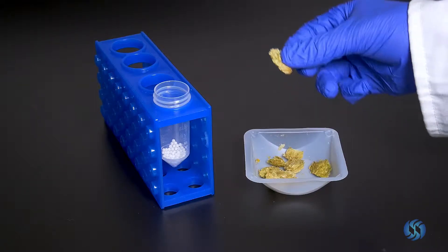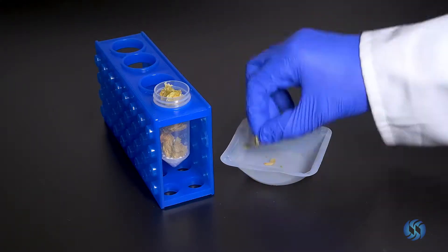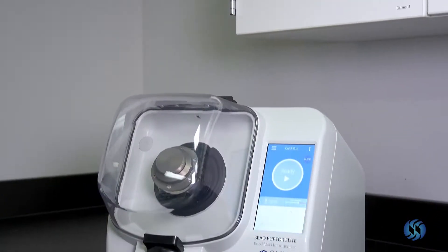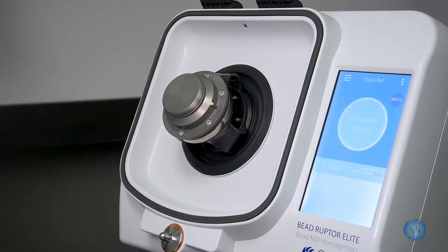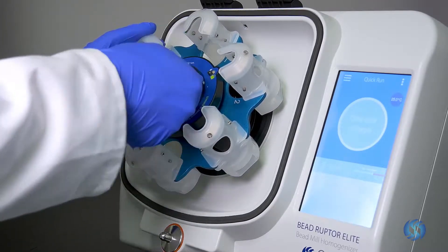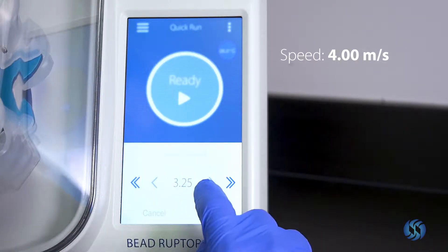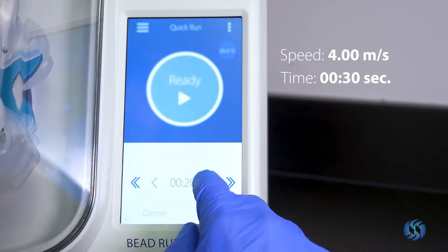Place your sample into a 30 milliliter tube pre-filled with 2.8 millimeter ceramic beads. Load the 30 milliliter tube into the Beadruptor Elite. Set the speed to 4 meters per second. Set the timer for 30 seconds.